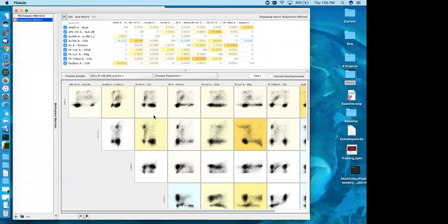So when you did this calculation using an algorithm on your acquisition cytometer, there we made sure the math was correct. The acquisition cytometer did a calculation to make sure that the MFI of background matched your single positive compensation controls when it did its balancing act. It's a little bit of matrix algebra to make sure that we have used our controls to properly set our compensation. And so these should all be correct for your single stain comp controls. And so what we're really just looking at here is making sure that our single stain comp controls properly matched our actual data. You can edit this matrix.